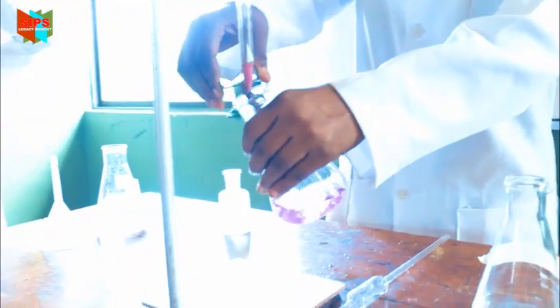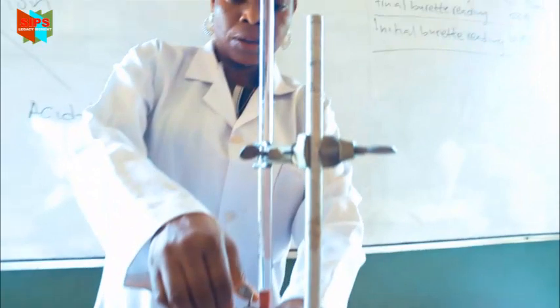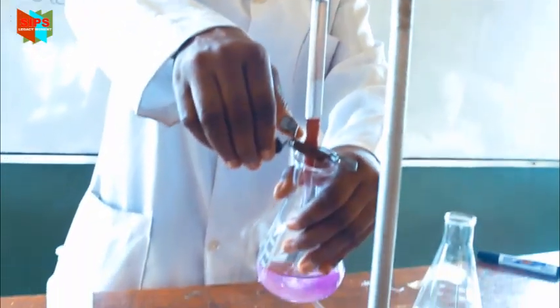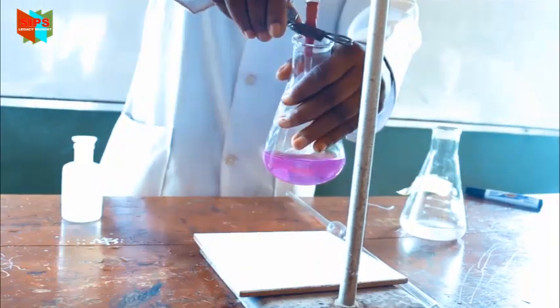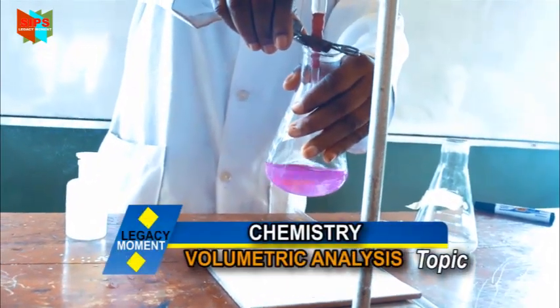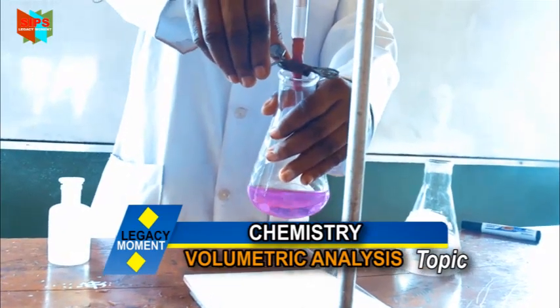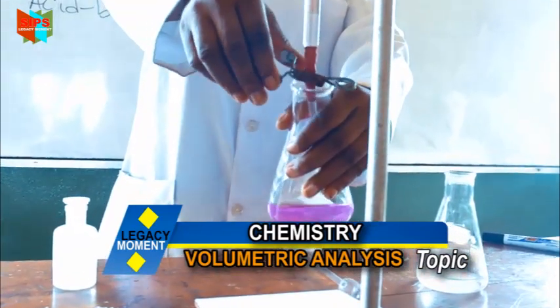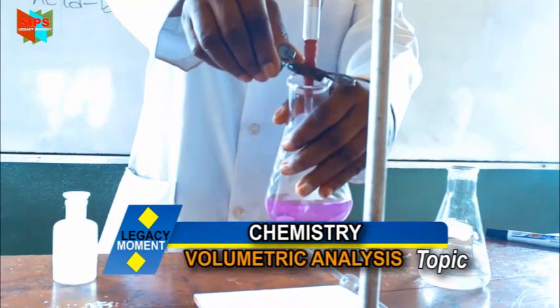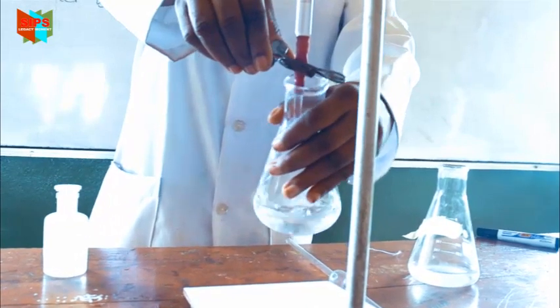So I'm going to titrate the acid against the base again. At this point, you can observe that any acid drop on the base in the conical flask, the color will change. It's almost changing to colorless. At this point, you know that you are almost at the end point. So you don't run it the way you were running it before. You add drop by drop. So we are at the end point.